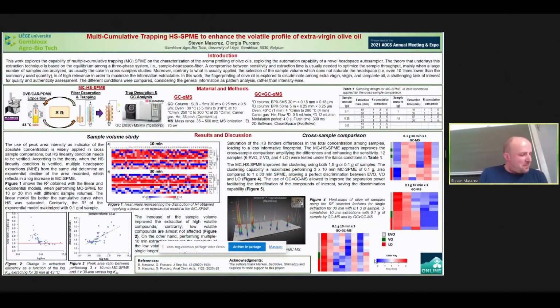So, still me. Thanks again for the opportunity to show another part of my work. Among the different techniques for volatile profiling of foods, headspace solid phase microextraction is probably the most widely applied, because the main advantages of this technique are that it's solvent-free, easy to automate, and flexible due to the different fibers available on the market.